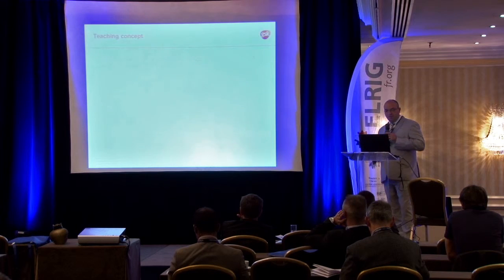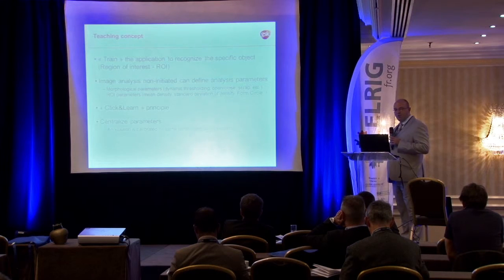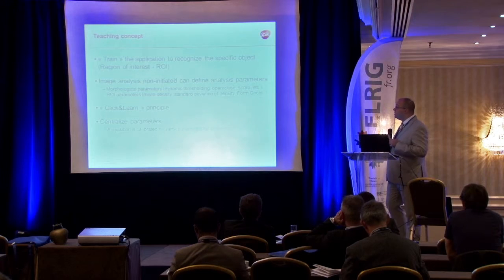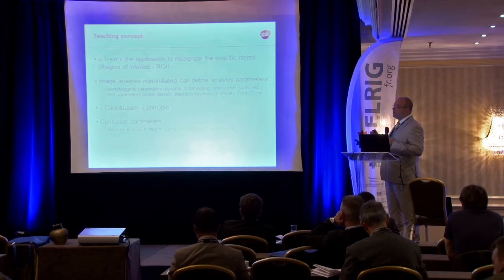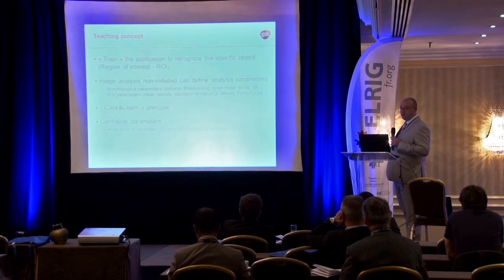Teaching and reading concept. The teaching concept is, in this principle, really basic. You can train the application to recognize your specific object. A specific object could be CPE or a bacterial colony, but you can train the computer to be able to recognize what is specific or not.